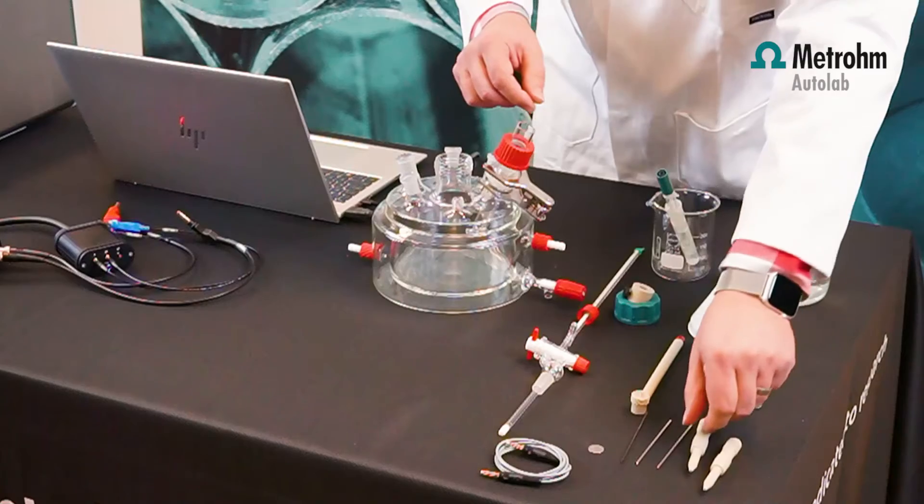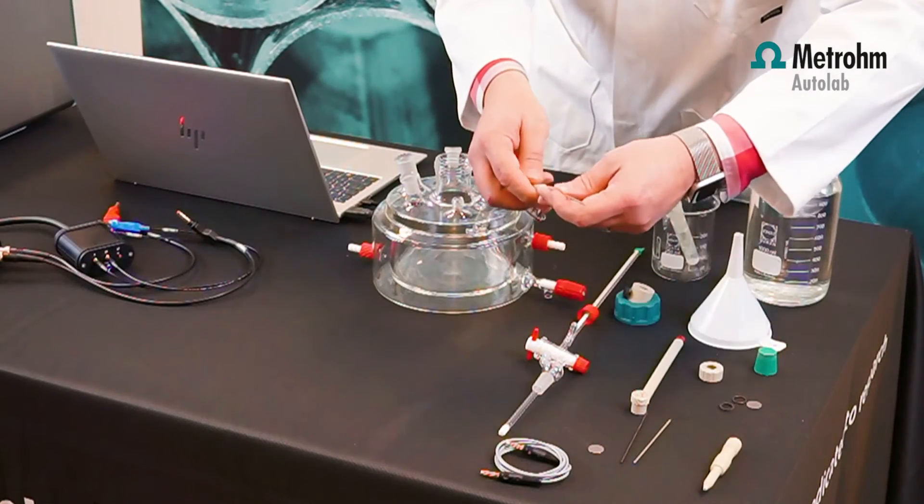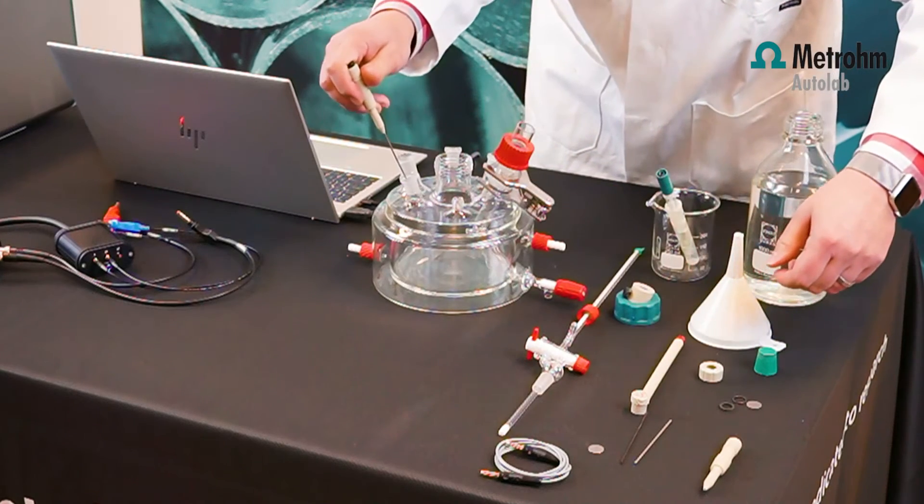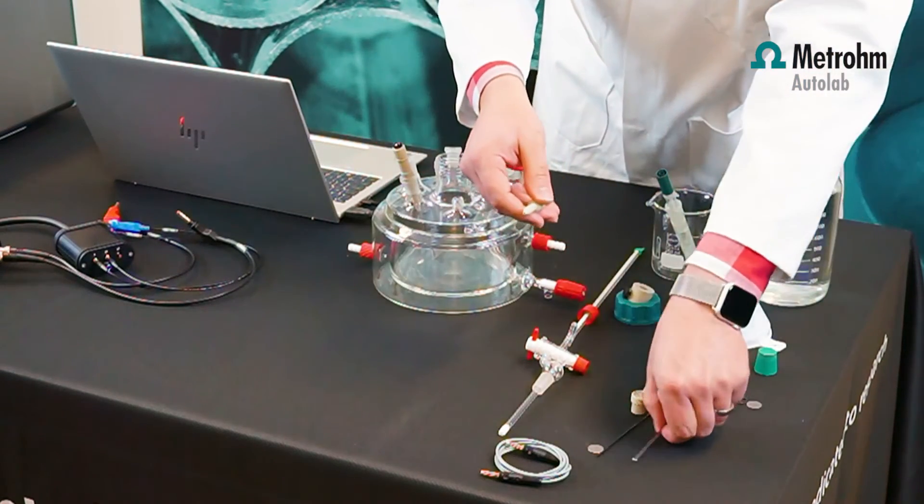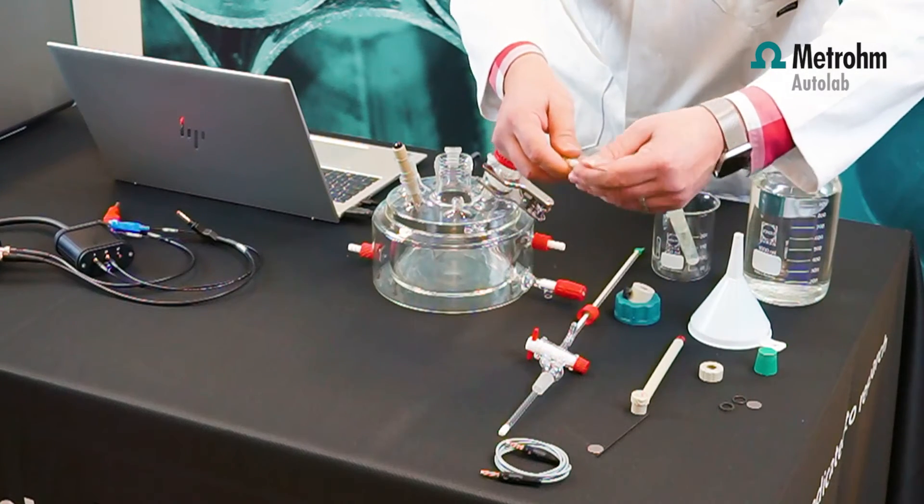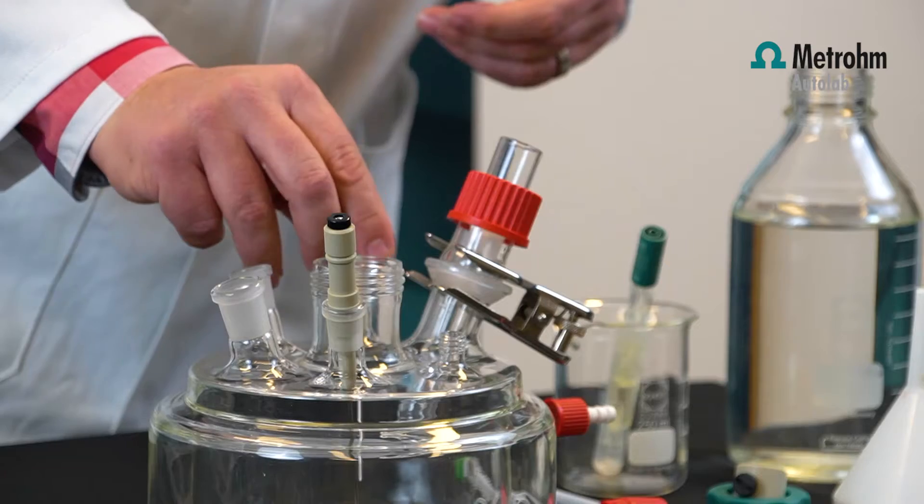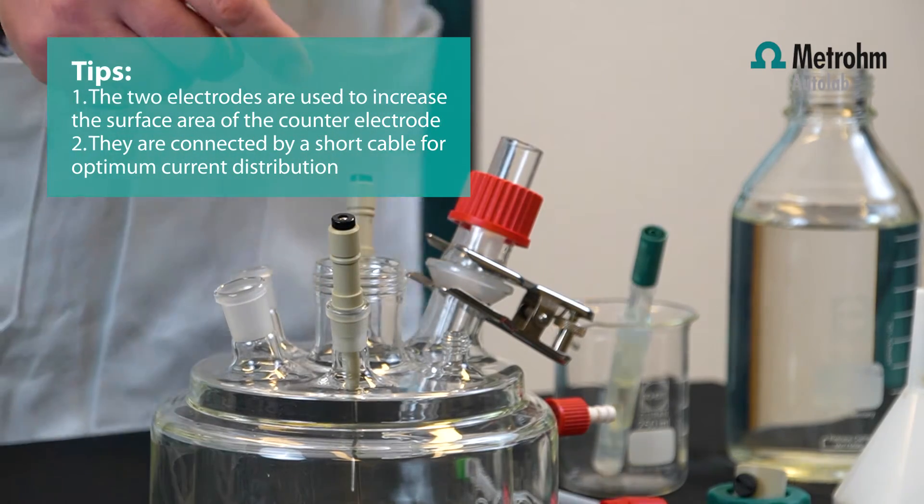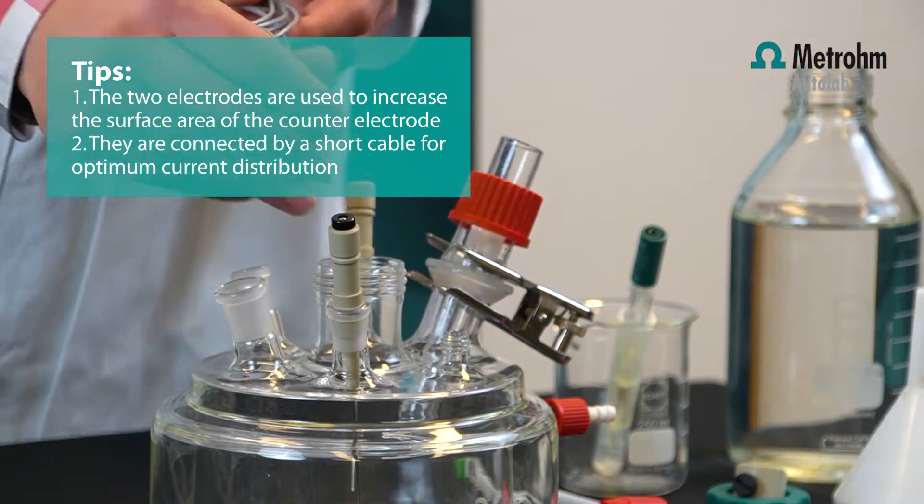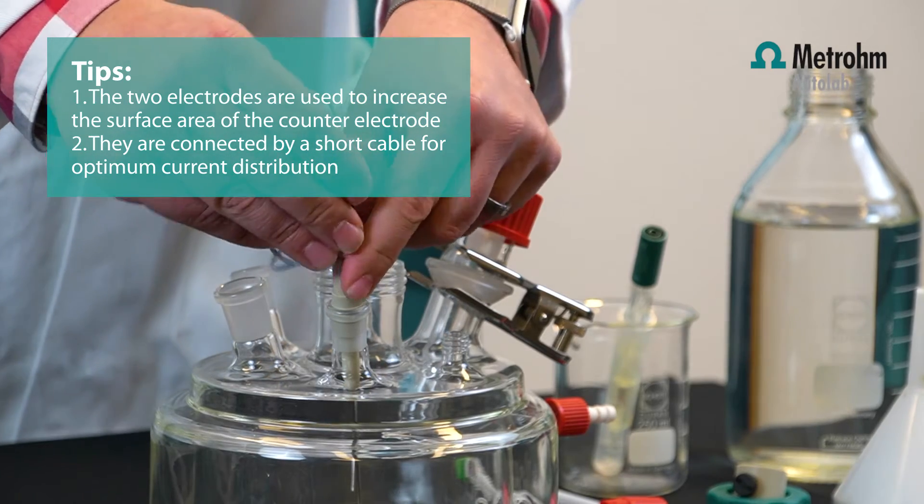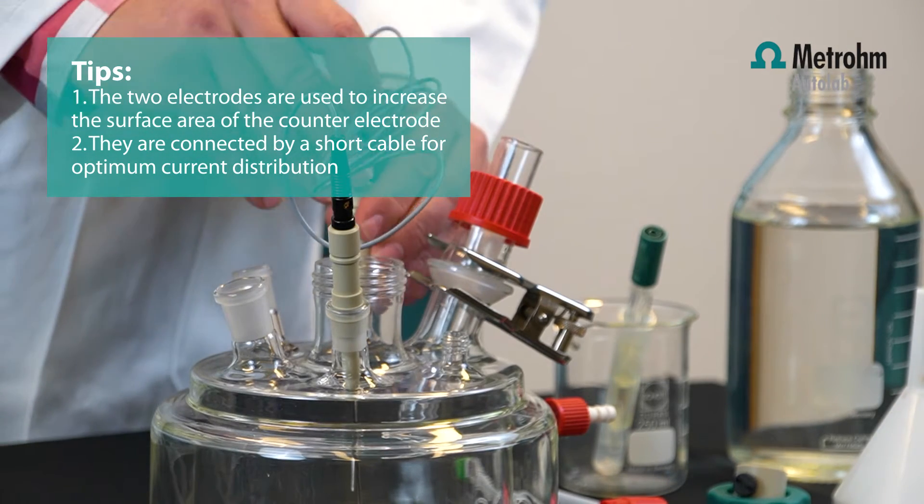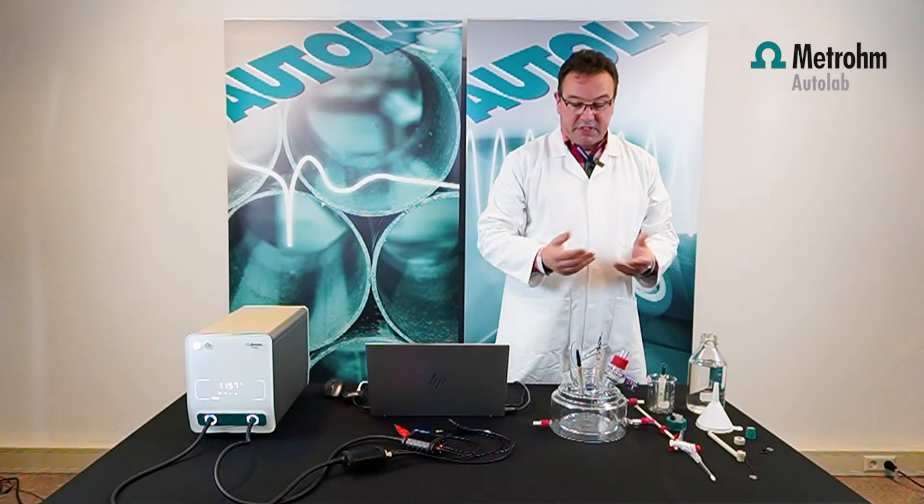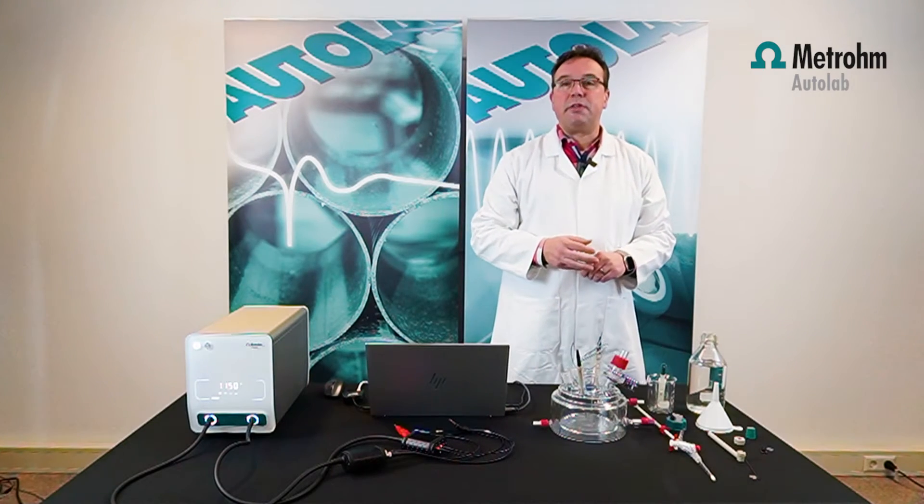Then we have the counter electrodes. Counter electrodes go in here, so we have the stainless steel on one side and stainless steel on the other side. Those two are connected with a small cable to increase the surface area of the counter electrode. The surface area of the counter electrode is important for proper current distribution. Standard it comes with stainless steel 316 electrodes.